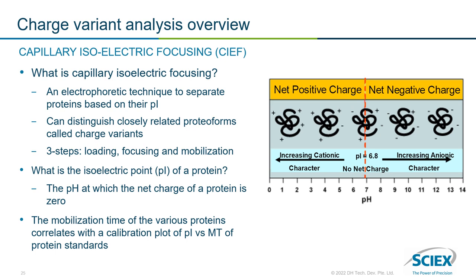The mobilization time of various proteins in the mixture correlates with the calibration plot of pI, or isoelectric point, versus mobilization time, enabling us to determine the pI of the protein species in our sample.